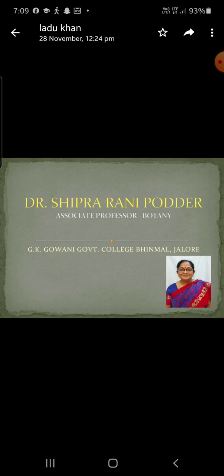The epidermis is followed by the hypodermis, which is composed of two types of cells. The outer 2 to 3 layers are composed of thin-walled chlorenchymatous cells and the next 4 to 5 of sclerenchymatous cells. There are 2 to 3 layers of sclerenchymatous cells on the adaxial surface of the rachis. Next to the hypodermis is the parenchymatous ground tissue with many mucilaginous canals.